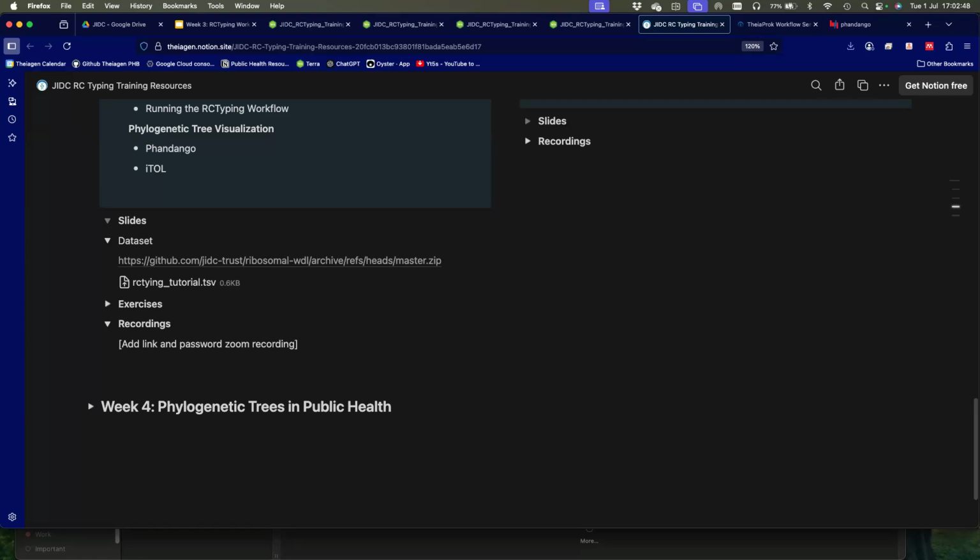I don't see why you wouldn't. So I think, yes, you can use it to undertake speciation, unless, is Claire still here? She could say otherwise. No. Yeah, but I think principally you should be able to undertake speciation analysis with this.